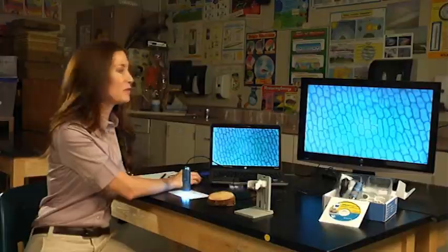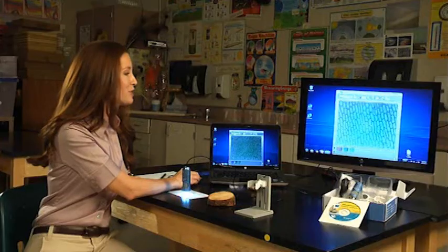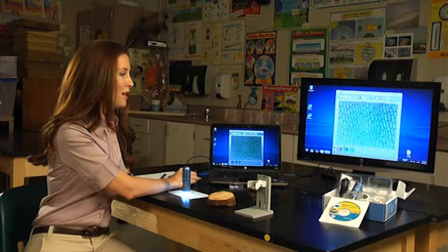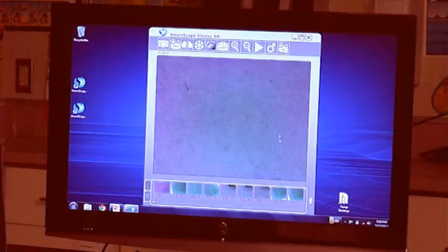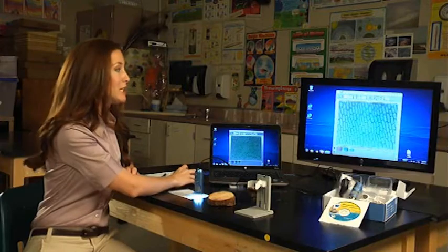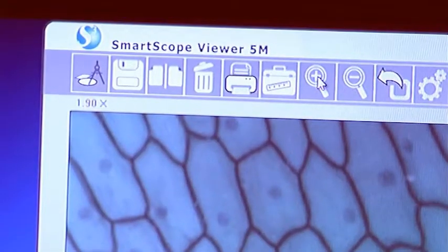In order to go out and view your photos, just double click again. That'll exit full screen mode. And you can see down here at the bottom, these are all the photos that we've taken. So I will just click on this last one and then drag it up into the frame. And there's our photo. It's really easy to zoom in further by clicking on the zoom in icon at the top.